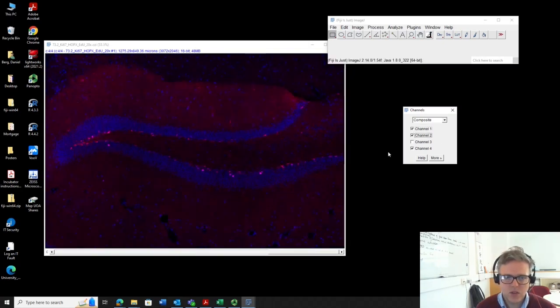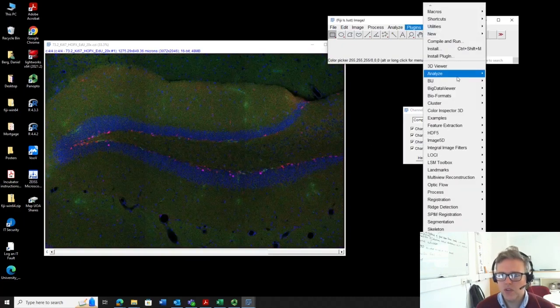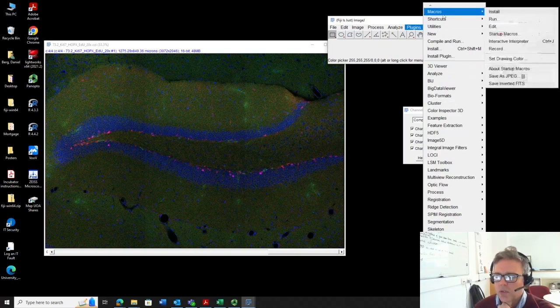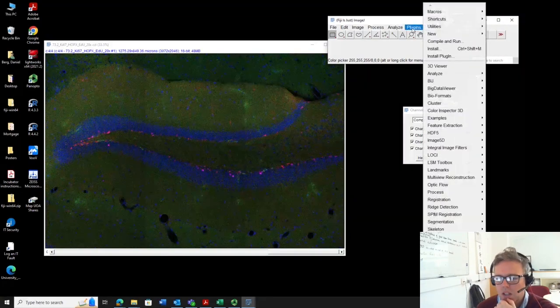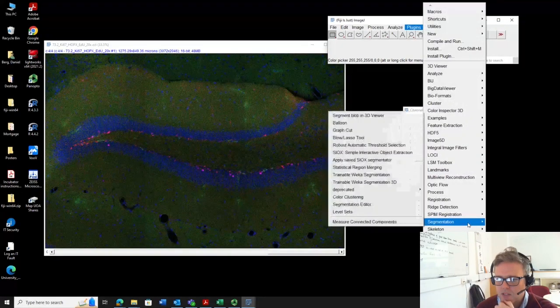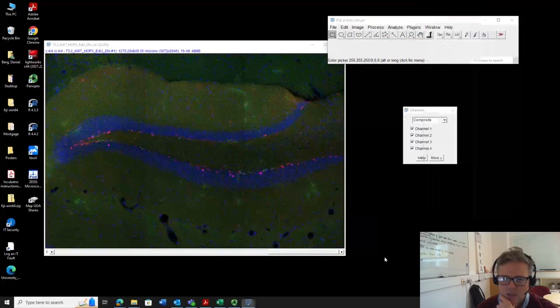You can systematically go through it. There are also plugins you can use. For example, Cell Counter is a plugin where the software can count the cells for you. It can be a bit tricky to get it started, but once you get it started, it should be faster.